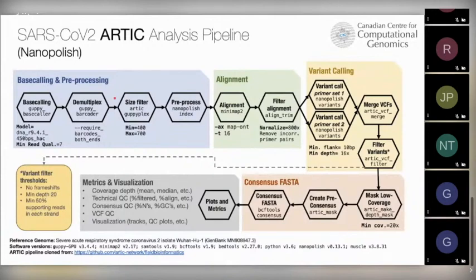One thing to note is that when you have long reads, especially long reads that cover pretty much the whole amplicon, there really is a much lower risk of including host information when you just use a regular alignment. In a short read, it's more expected that a shorter region could map to both the human genome and the virus genome, but a full amplicon would rarely map to both the human genome and the virus genome.